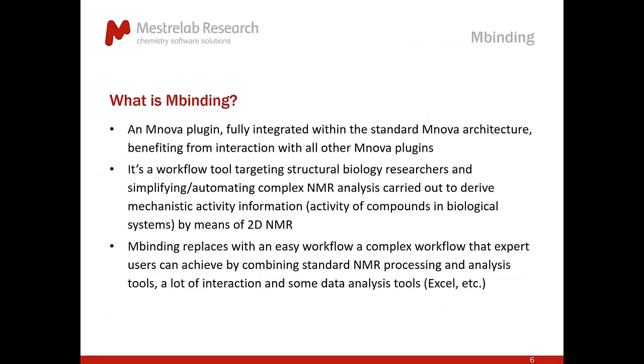Like I just explained, it's an Mnova plugin. What this means is that it's fully integrated within the standard Mnova architecture. The good news is that if you are used to using Mnova, for example, for processing NMR data, you are able to benefit from all the capability that is in Mnova NMR, but to drive a workflow which, if you like, is a little bit more specialized or more advanced. It's being developed as a workflow tool, and what we are targeting is structural biology researchers.